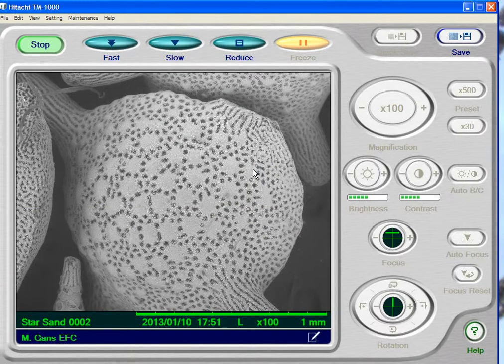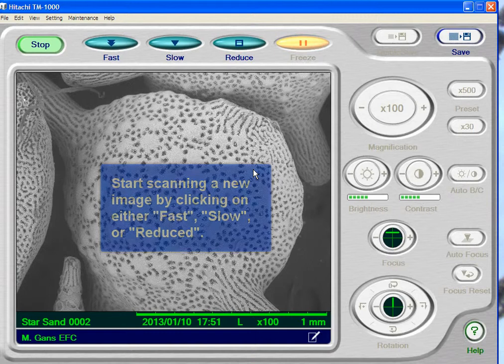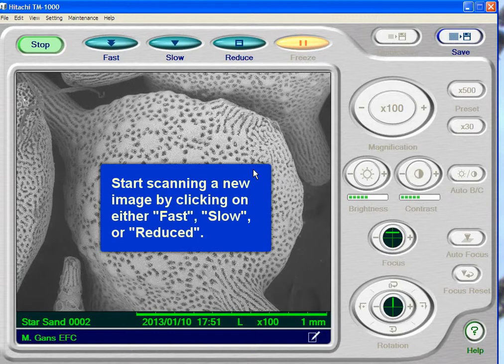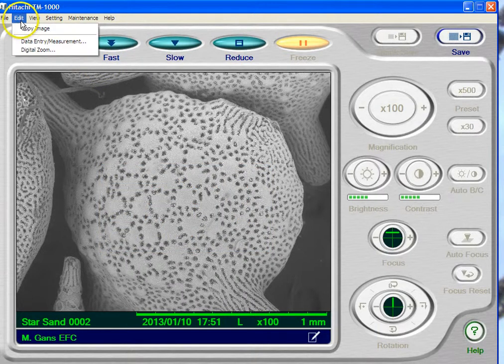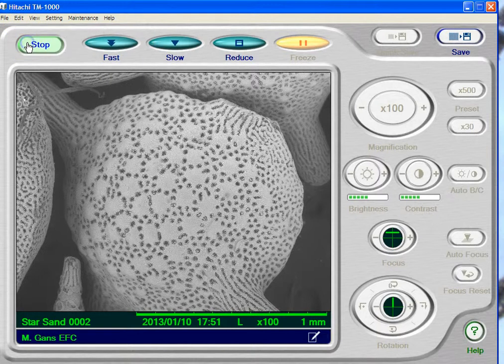You'll notice we actually don't have a live picture anymore. So how do you make the picture live? I'm going to make the picture live by clicking either Fast, Slow, or Reduce. But before I do that, I want to show you the cool thing that this scope does — you can make direct measurements on the pictures. So I'm going to go under Edit and into the Data Entry Measurement.